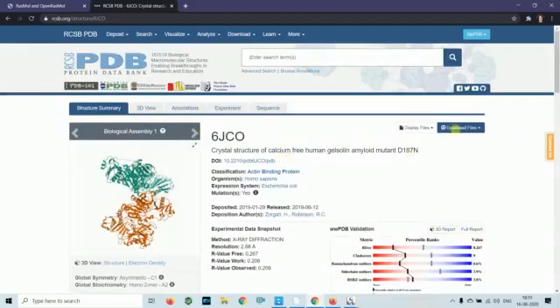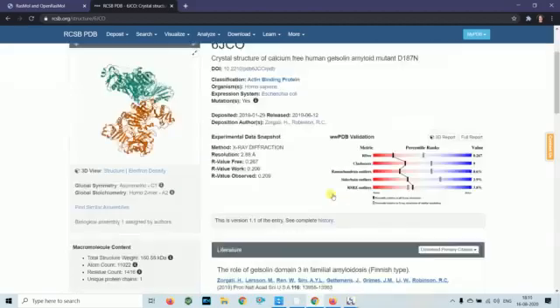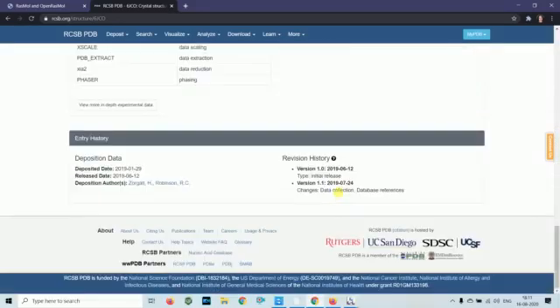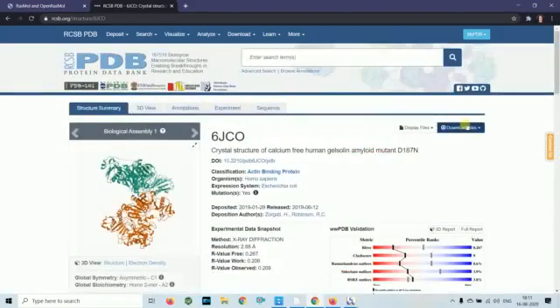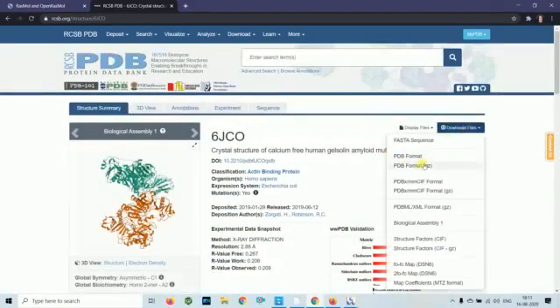Now we will download the file. We will download the PDB format.